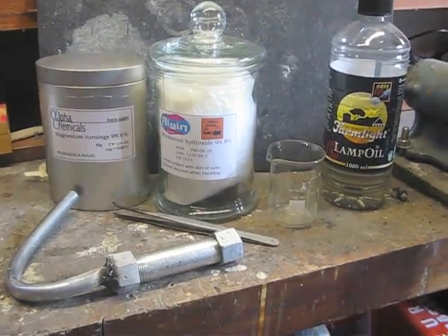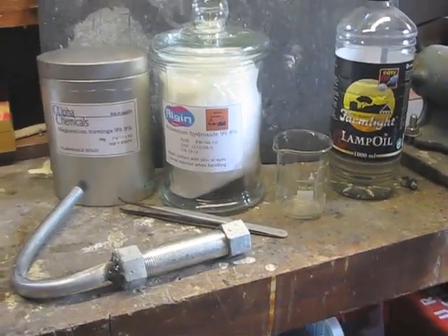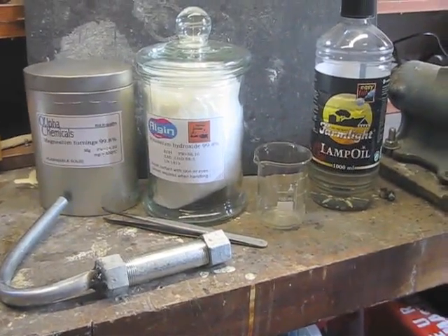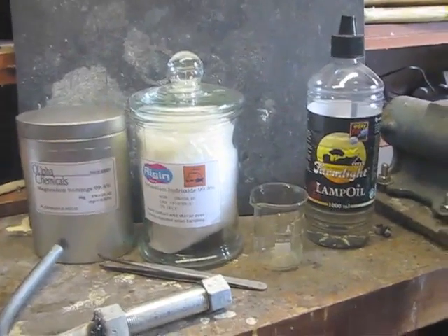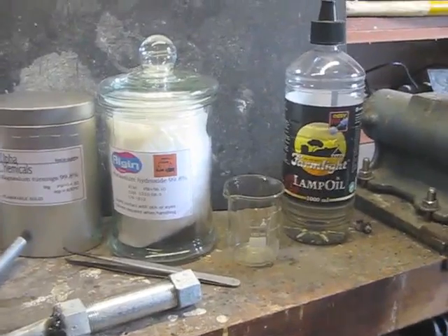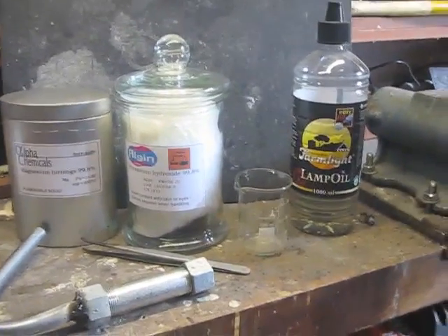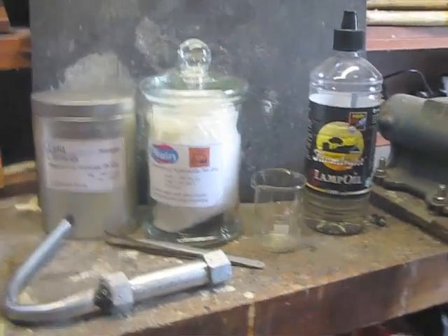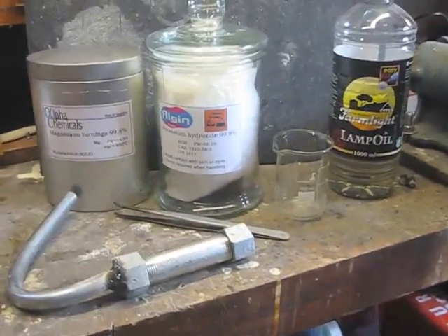This is the next test, after the sodium experiment. In this experiment I will try to make potassium metal. On the left you see magnesium turnings, in the middle you see KOH potassium hydroxide, and on the right you see lamp oil to prevent getting air into the retort.